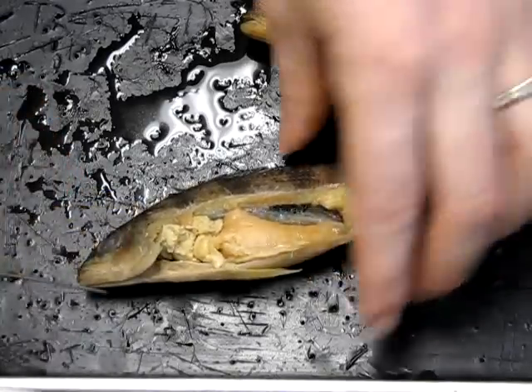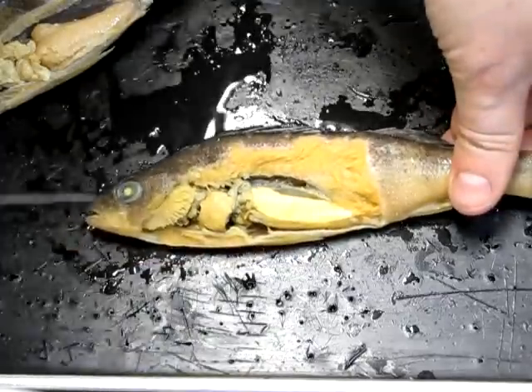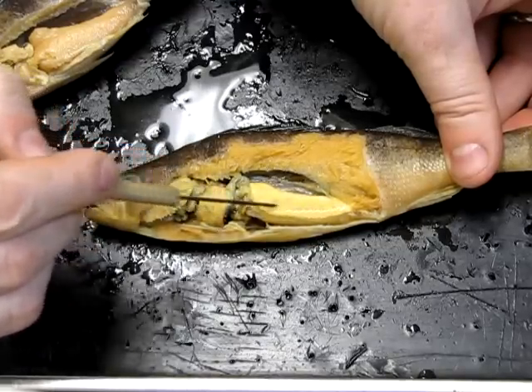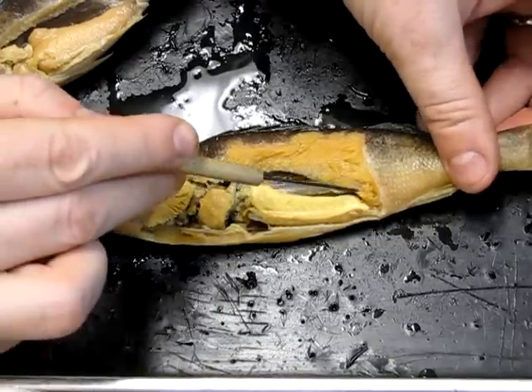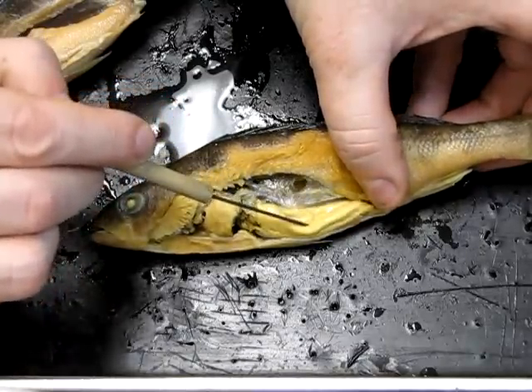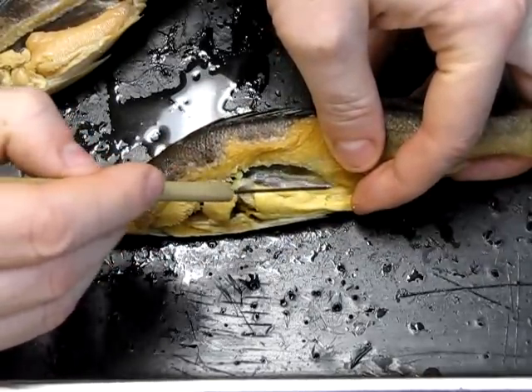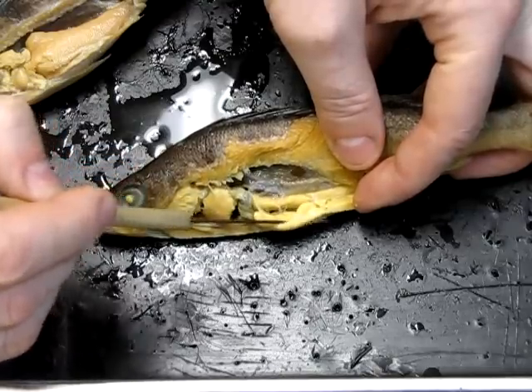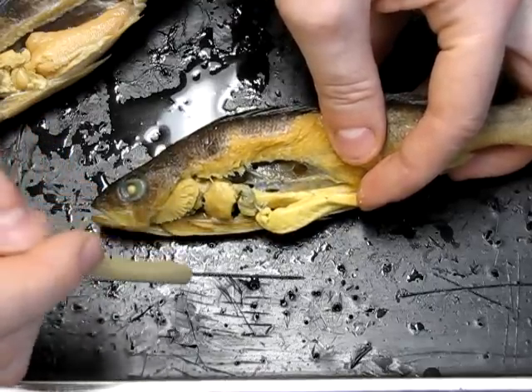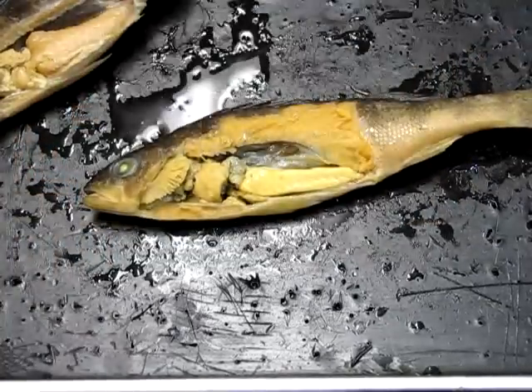Looking at the male, the structures are mostly the same — here's the liver and the swim bladder membrane — but this is where things differ. This is one of the male gonads, the testis. Lifting it aside, there's another one lying underneath, so there's actually a pair of them. The fact that there are two tells us they are testes; males have two gonads, not one like the female, and this is how you distinguish male from female.